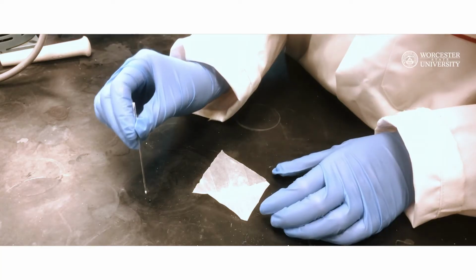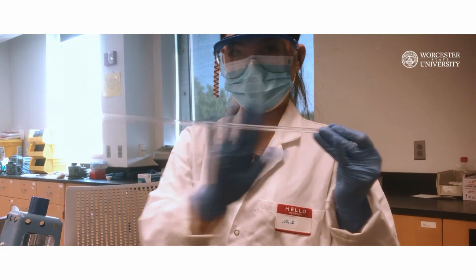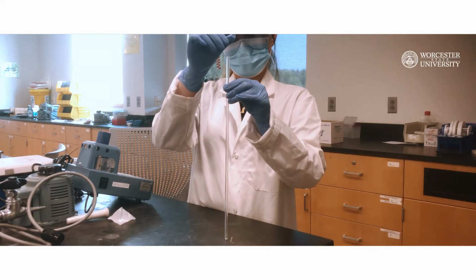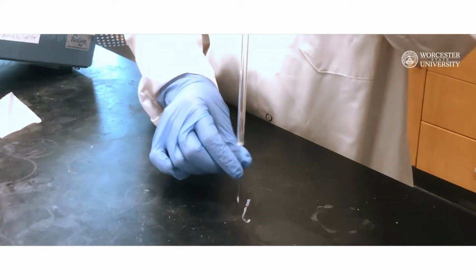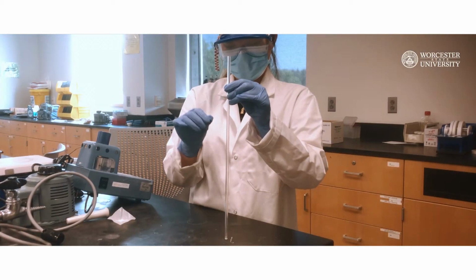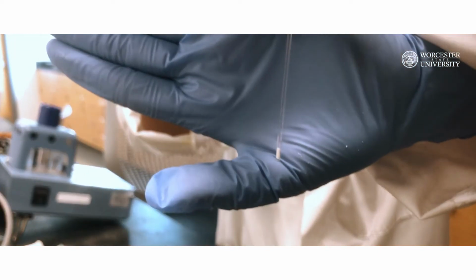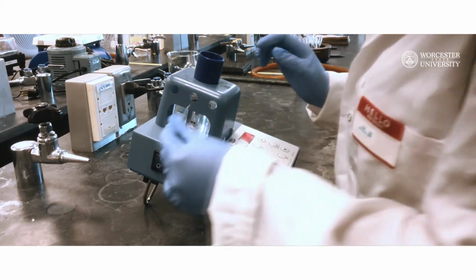If the sample height is less than 2 millimeters, you can repeat the previous steps to introduce enough solid into the capillary tube. Once you place enough sample in the capillary, obtain a long piece of straight tube around 1 meter, keep it standing vertically on the bench top, and drop the capillary tube into the long tube. When you let go of the capillary, it will fall down and bounce a few times inside the tube. This helps push and pack the sample at the bottom of the capillary tube. You can repeat this step as many times as you need. Usually 3 to 4 times are enough to pack the sample nicely at the bottom. Observe to confirm.